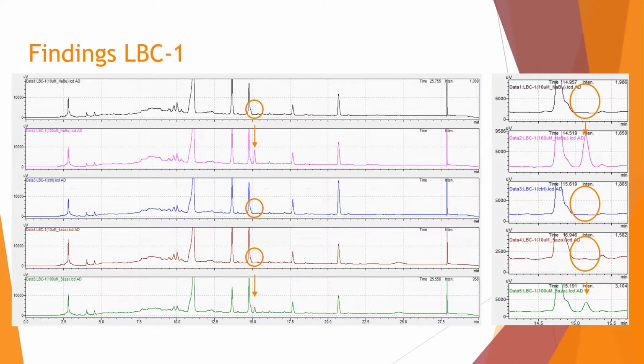Do both of your treatments have the same structure? No. Right. So if you're treating the same retention time, and Dr. Harrison's asking, is that the molecule that we used to treat with? No, it is not. Awesome. Great controls. Controls are so important.